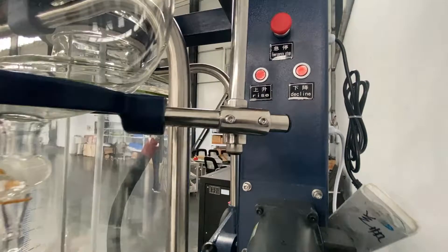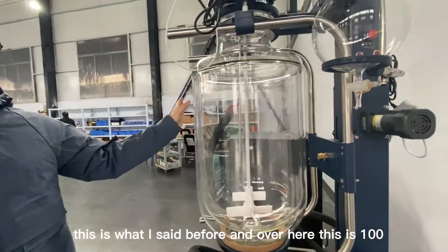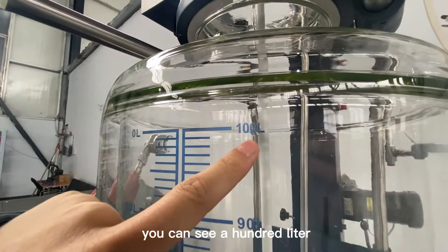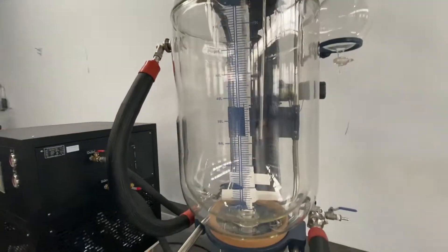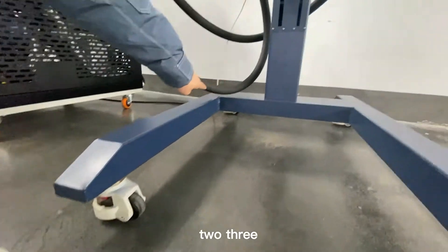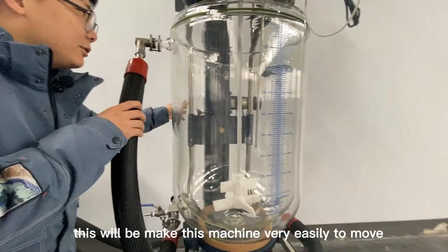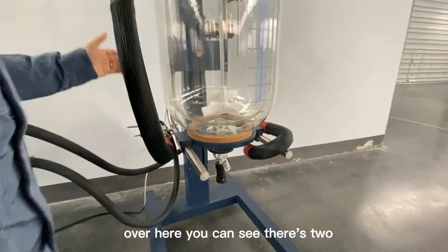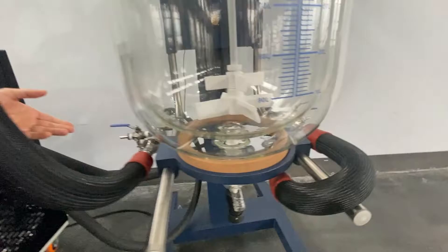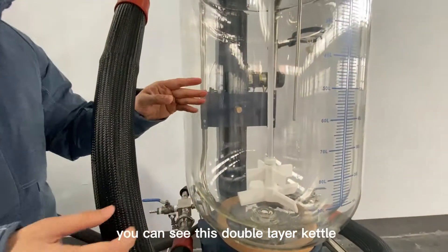Over here this is a 100-liter kettle. You can see it is 100 liters. Over here you can see there are four wheels — one, two, three, and four — which makes this machine very easy to move. On the ground over here you can see there are two black lines, which can provide high temperature and low temperature for the outer layer.